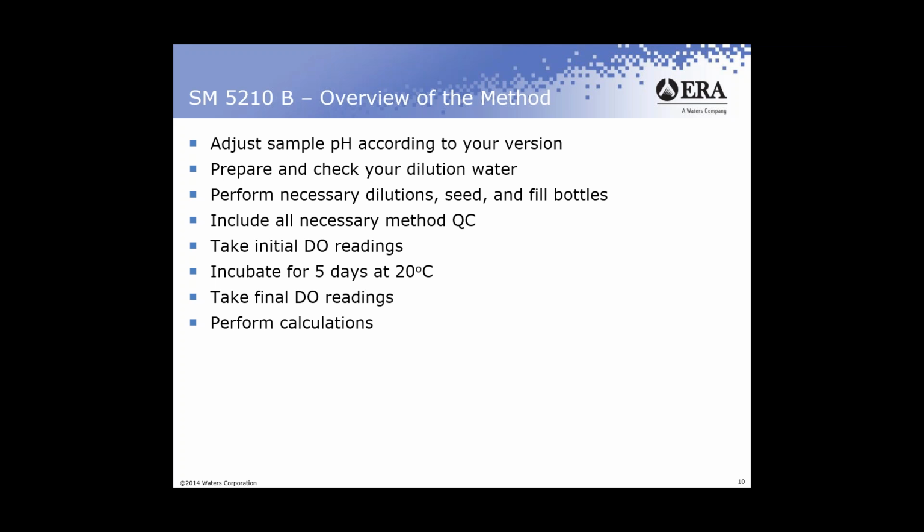Then it tells you to prepare and check your dilution water. Quality dilution water is very important for the successful analysis of BOD. We'll discuss that a little bit later on as well. You want to perform necessary dilutions.